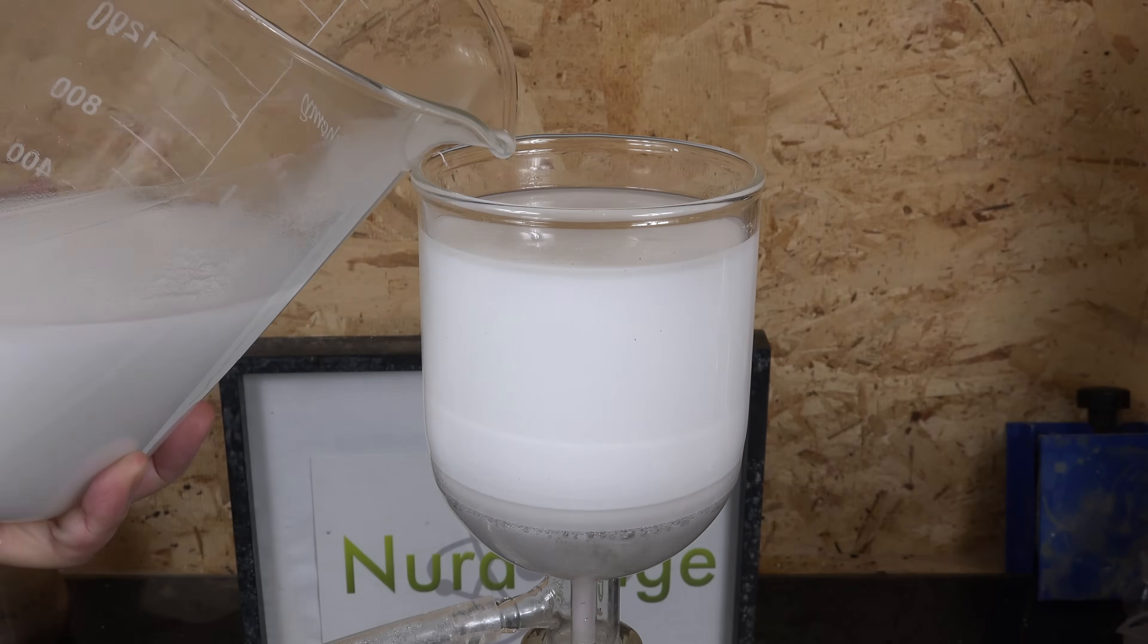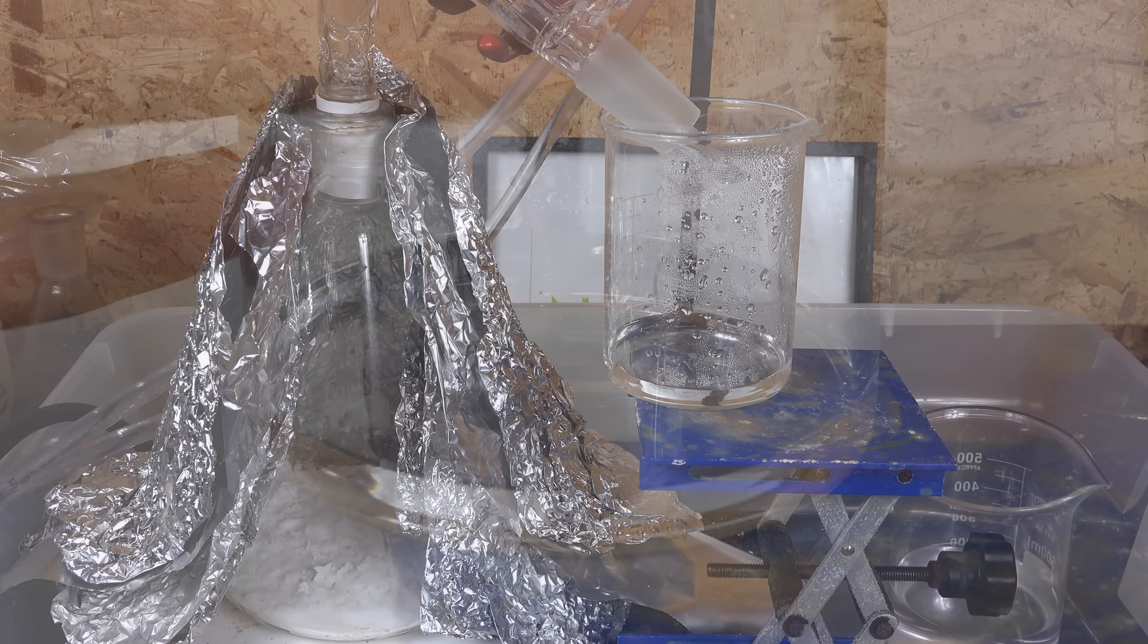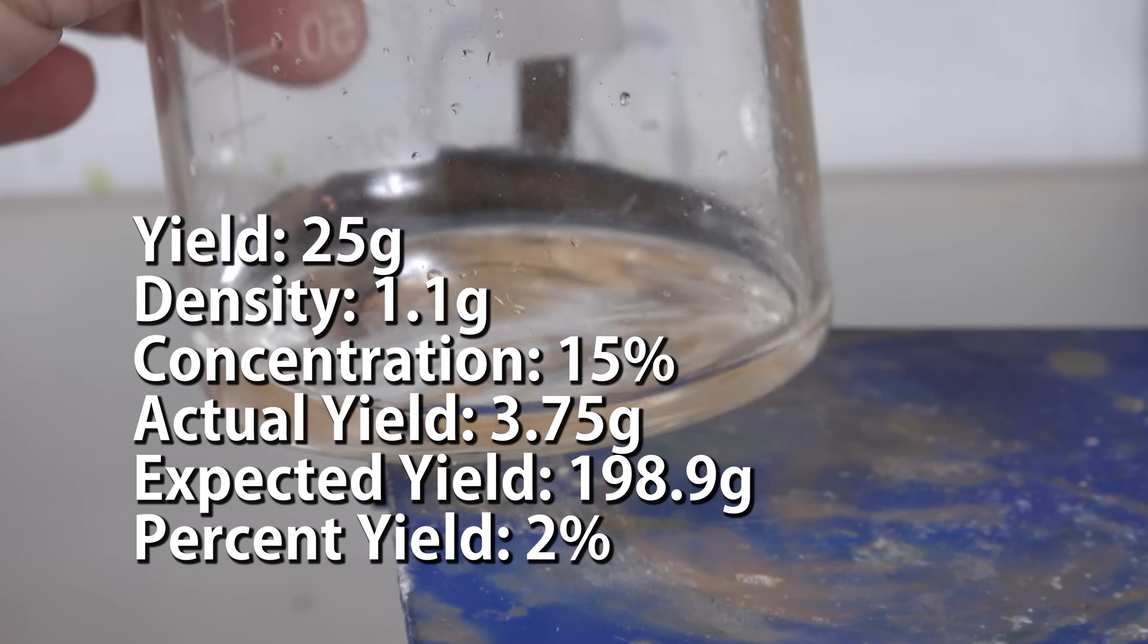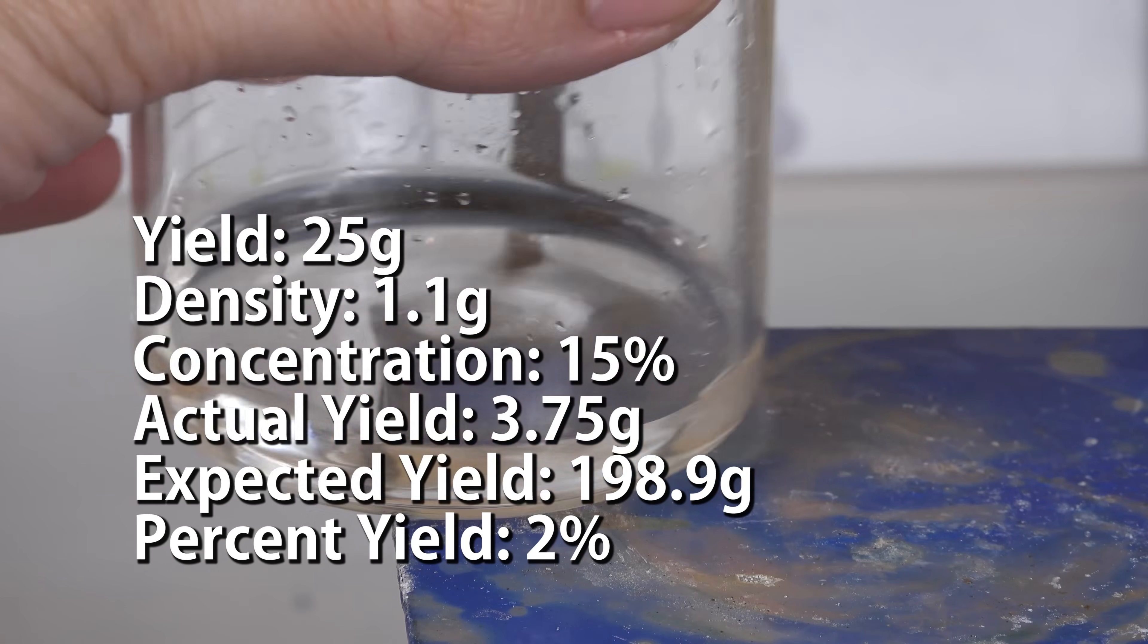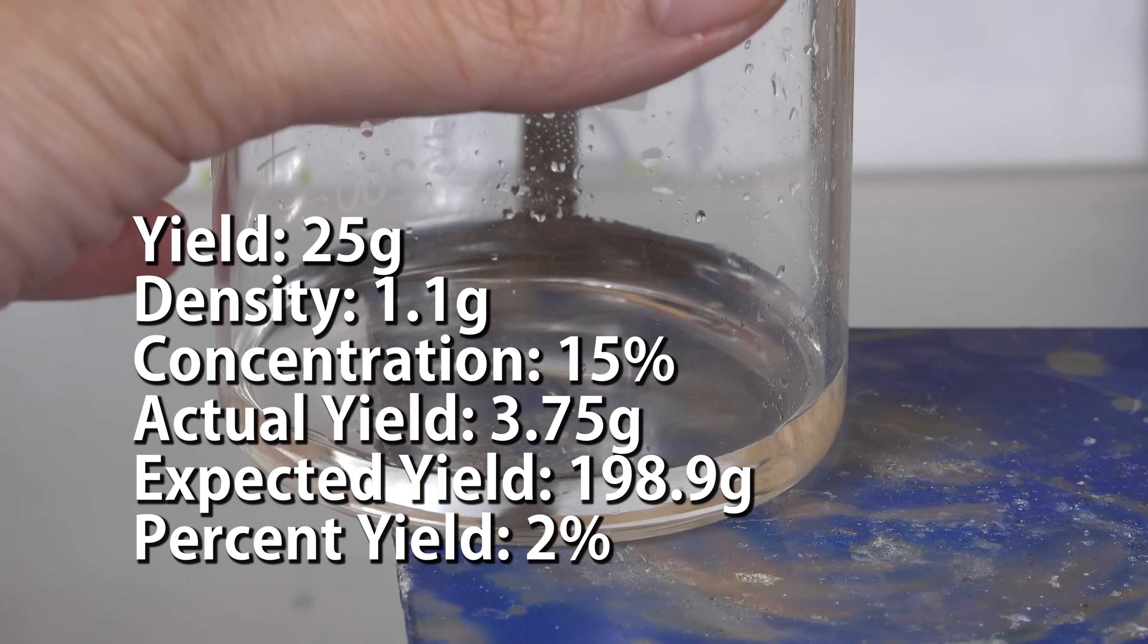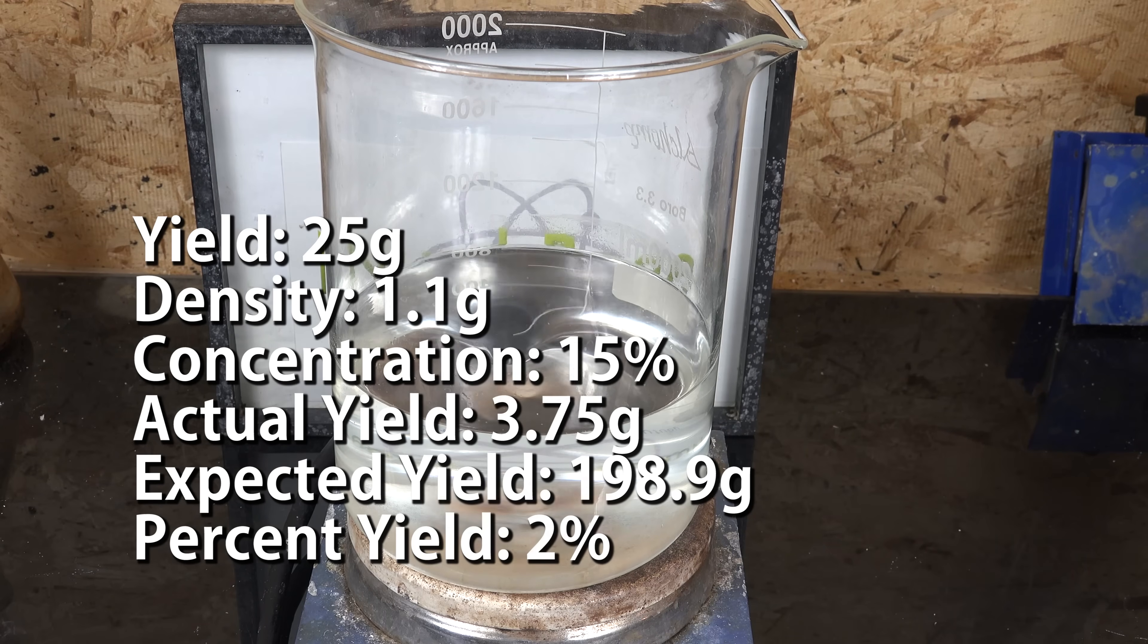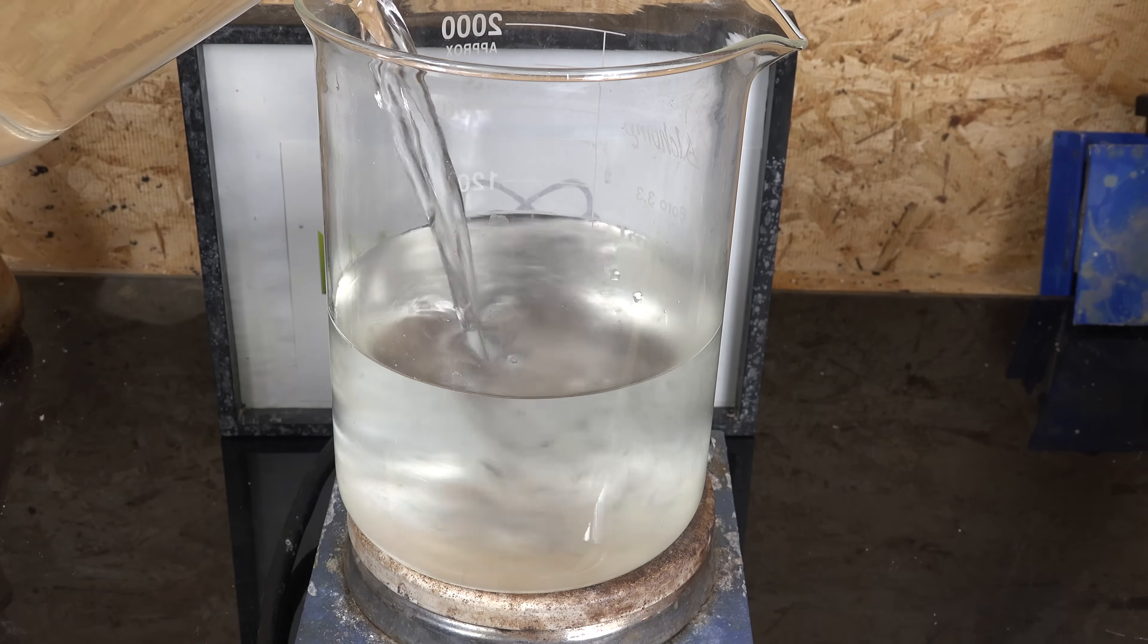After boiling them and mixing them together I got a precipitate and I thought it was working. So I filtered them, boiled them down and then proceeded to distill the acid. The final amount I obtained was 25g at a density of 1.1g for a concentration of about 15% or about 3.75g of actual yield.